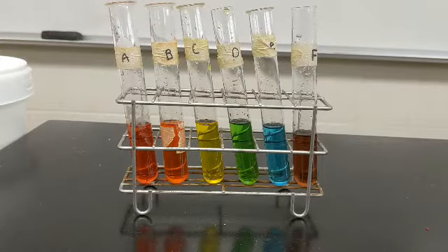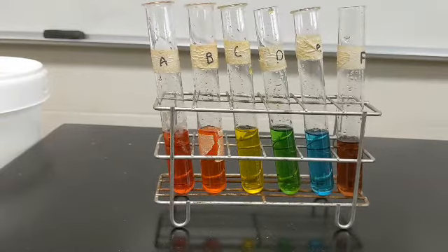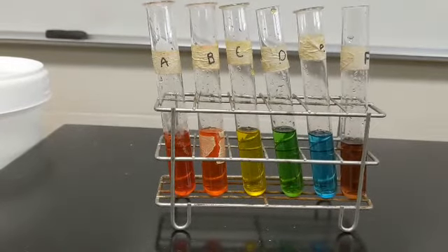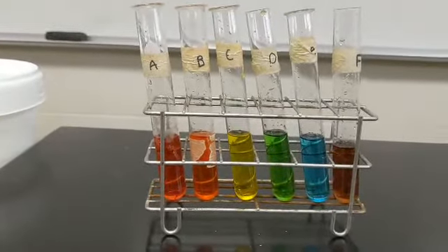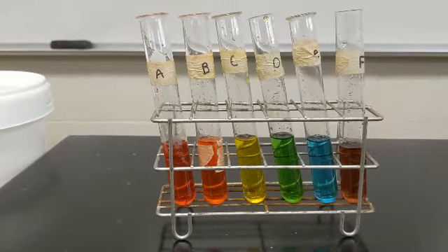Okay, so now let's go fill in the data table, okay? For test tube A, all we did was we added red water to test tube A, okay? So that's what you're going to write in for the color of water for test tube A. B, we added yellow to red, and it might not be showing up as orange as it is, but test tube B is orange. So you're going to type orange into the color of water for test tube B.